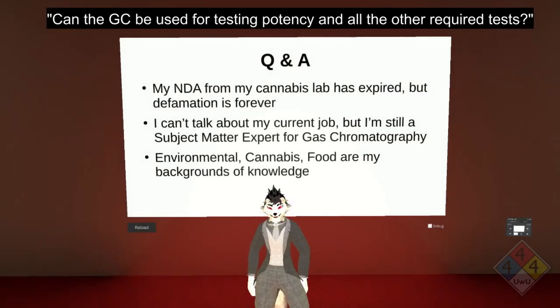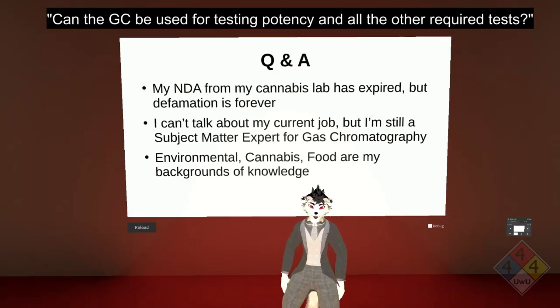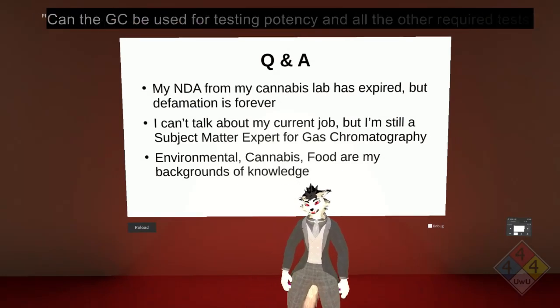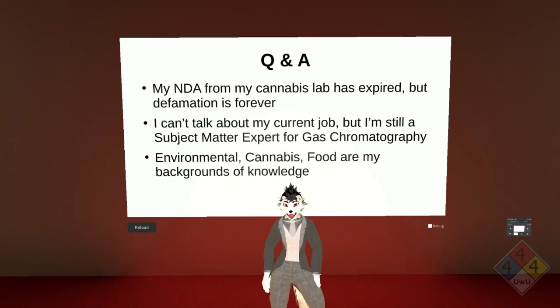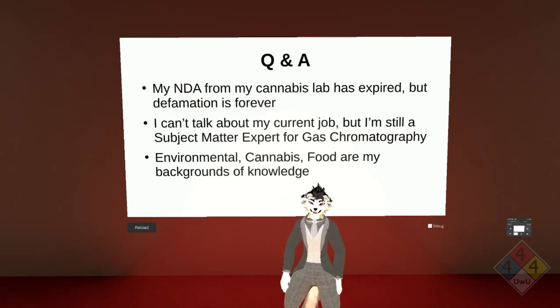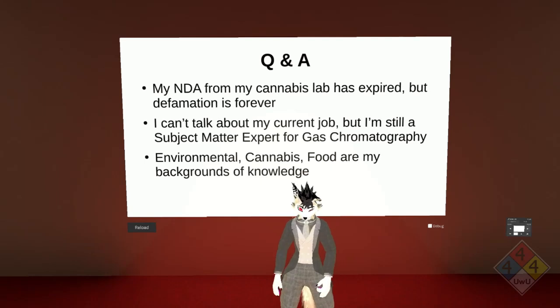Action limits, sensitivity, and such, because it all depends on what you're looking for and to what sensitivity limits you need. All right, so basic question. Why can we not do quantification of cannabinoids on a GC FID, right? FIDs are very capable of the detection. The columns can separate out the different cannabinoids.